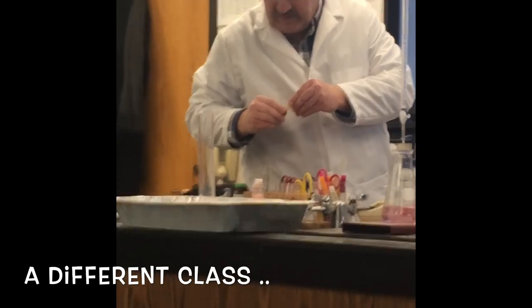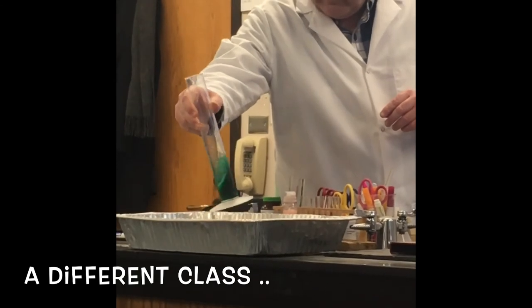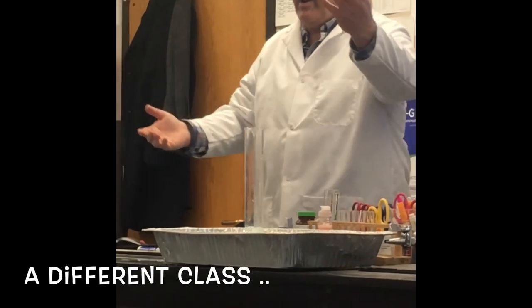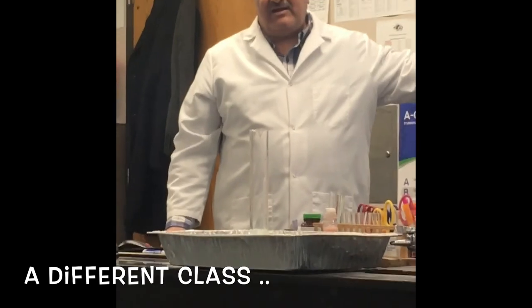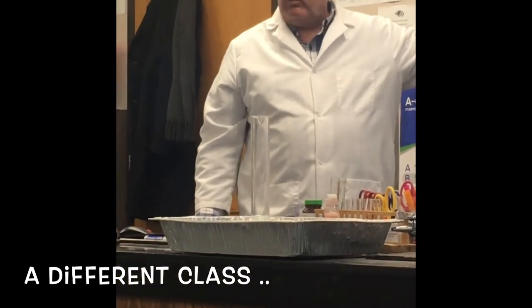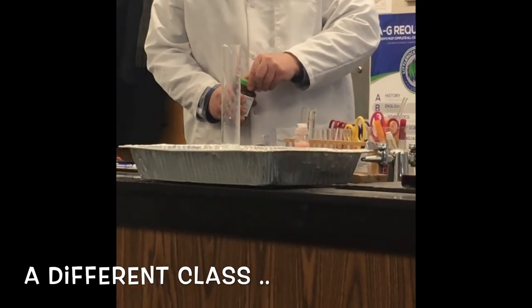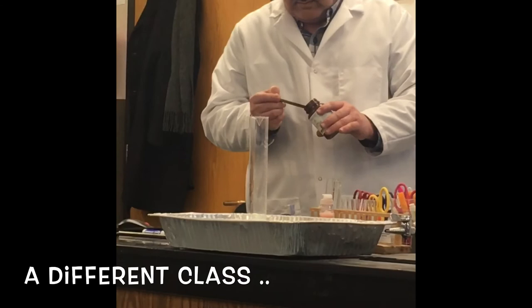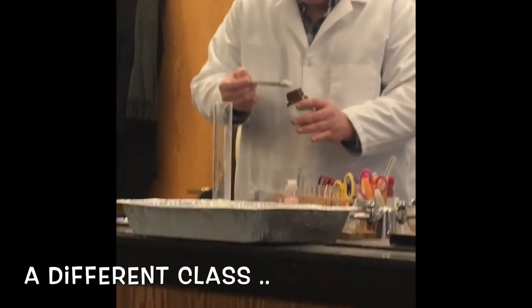Now, I'm going to mix these together over here. Whoa! Okay. Guess what? There's no reaction. Why not? What's missing? The catalyst. You need the catalyst. What's the name of the catalyst? Potassium iodide. Here it is. Pay attention. The reaction is not going to happen until you add the catalyst. Did you already put the hydrogen peroxide in there? Okay, here we go.